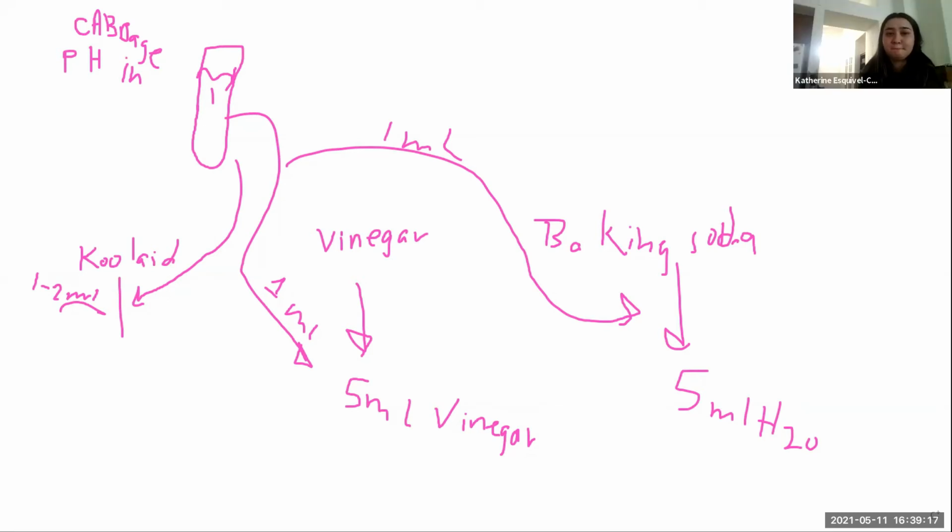Okay, Henry. Yep. So for steps 7 through 10, all 3 of them went over the 15 milliliters. Then what you want to do is take 5 mils as your original solution, and then you're going to dilute it.